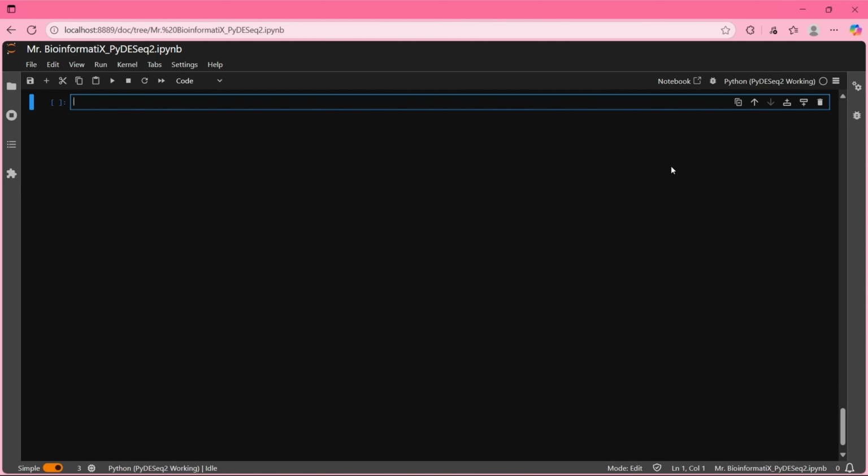P-values are computed as earlier from a DeseqStats object with the summary method. The contrast argument will allow us to determine which variables we want to obtain log-fold changes and p-values for. So the first one is the variable, and then the tested level, and then the reference. So, for example, ds, B versus A equal to DeseqStats.